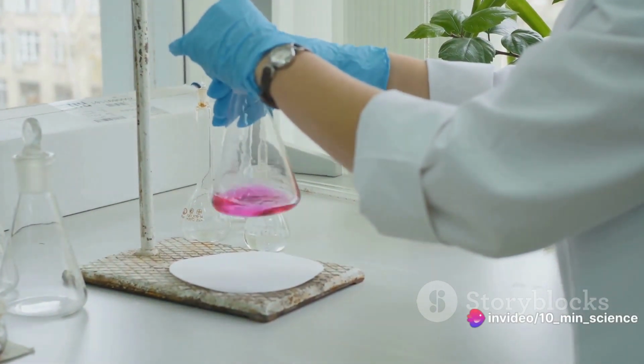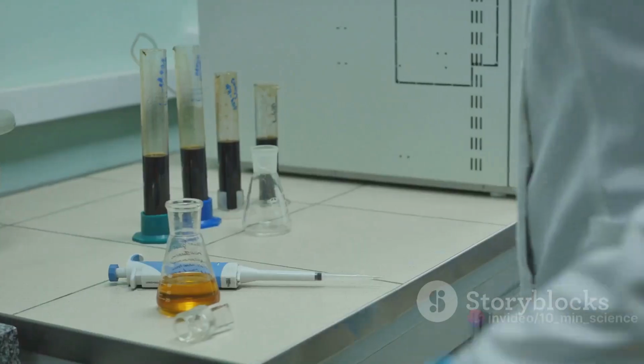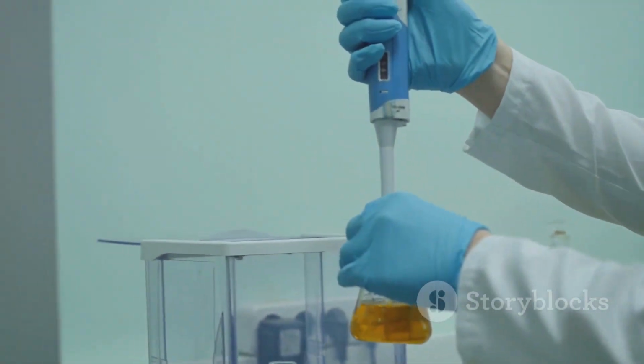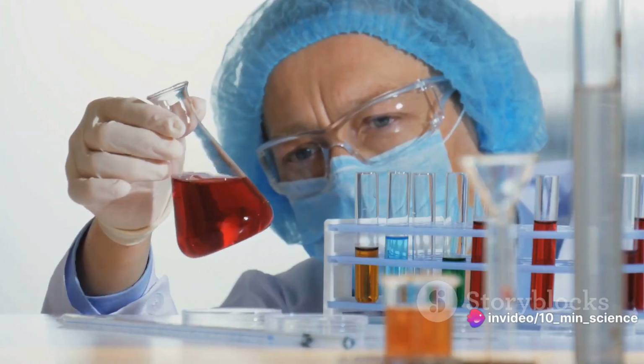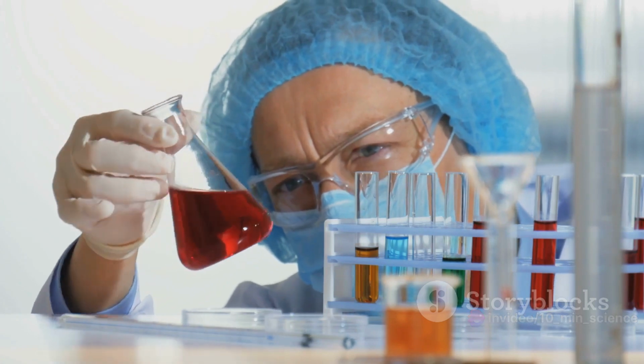Next, we run the HPLC analysis. Both the analyte and the internal standard are co-eluted, meaning they are forced through the chromatographic system at the same time. This allows for the internal standard to compensate for any variations in injection volume, flow rate, or detector response that could affect the analyte signal.